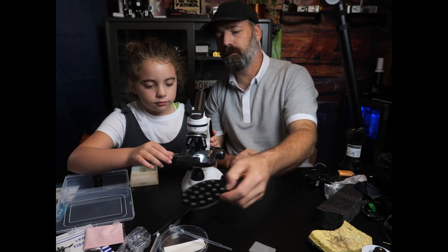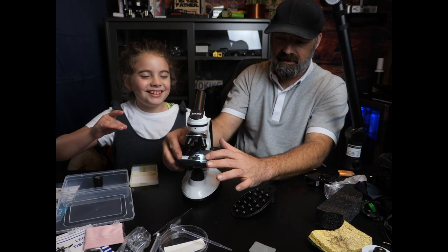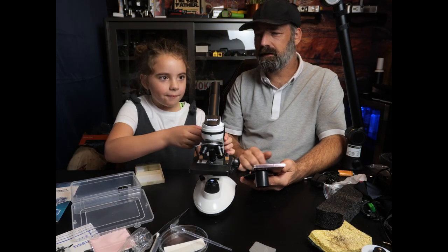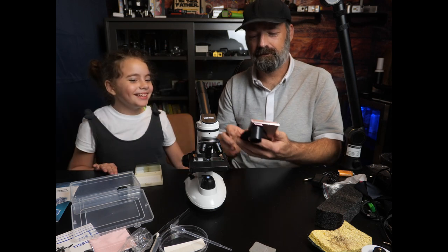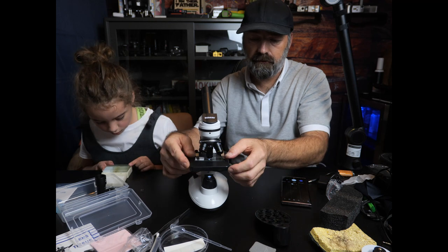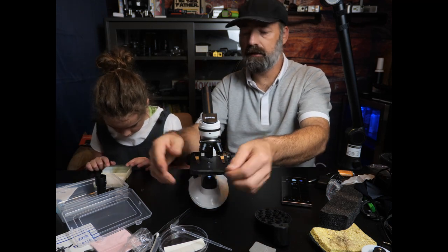All right, are you ready to play with this, Lizzy? Which slide are you going to put in? The small intestine slide? I want to see what it looks like. I'm a little scientist! Go ahead, look in there. What's that look like? Creepy — looks like space. Ready for a new slide? We're going to raise it up and pull the slide out. Which one do you want to look at next?